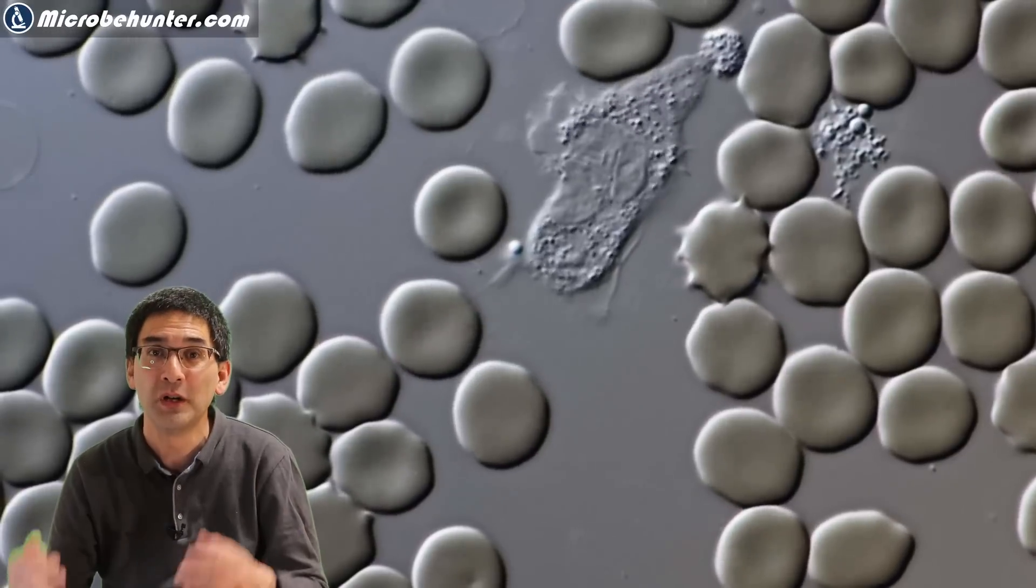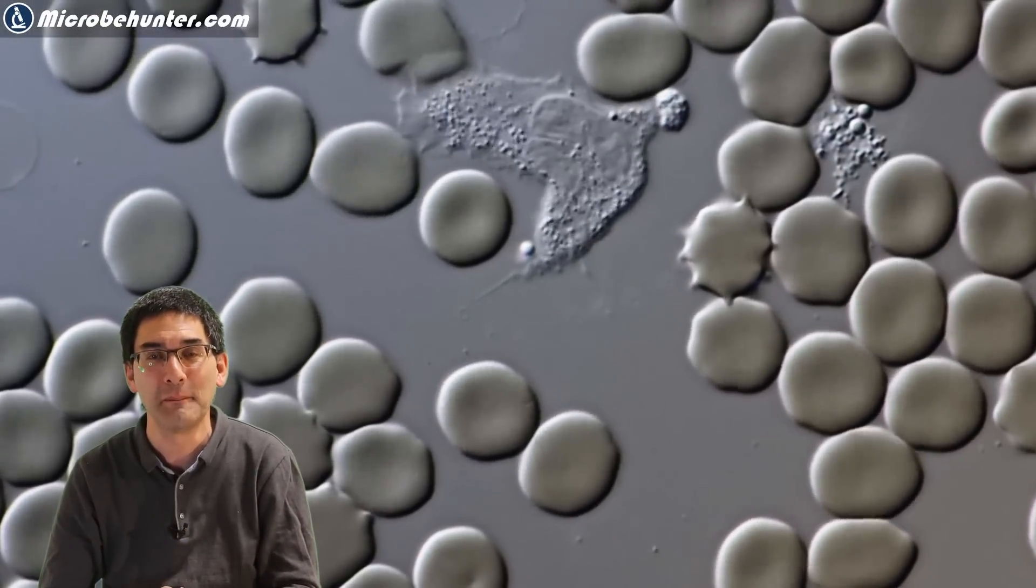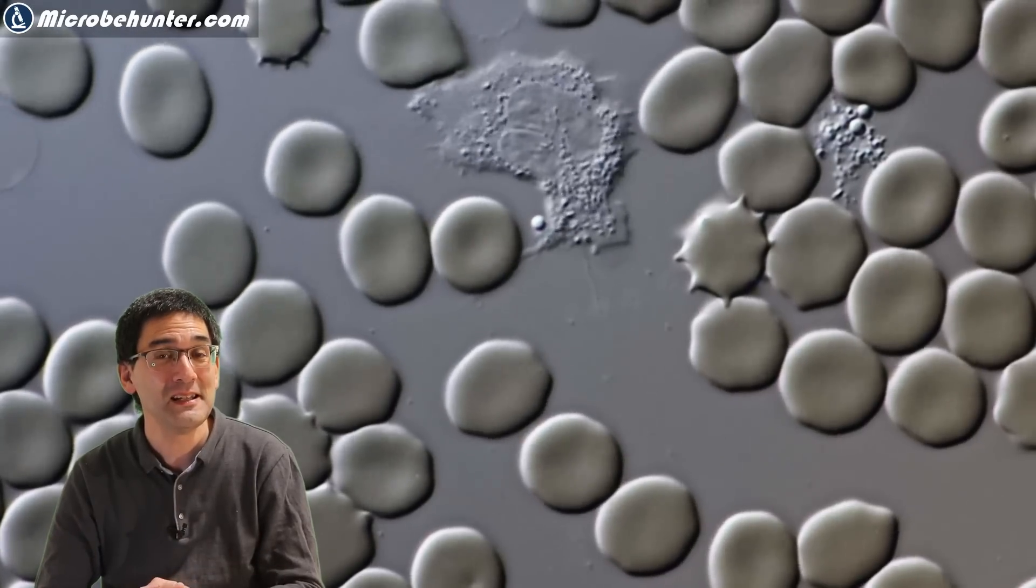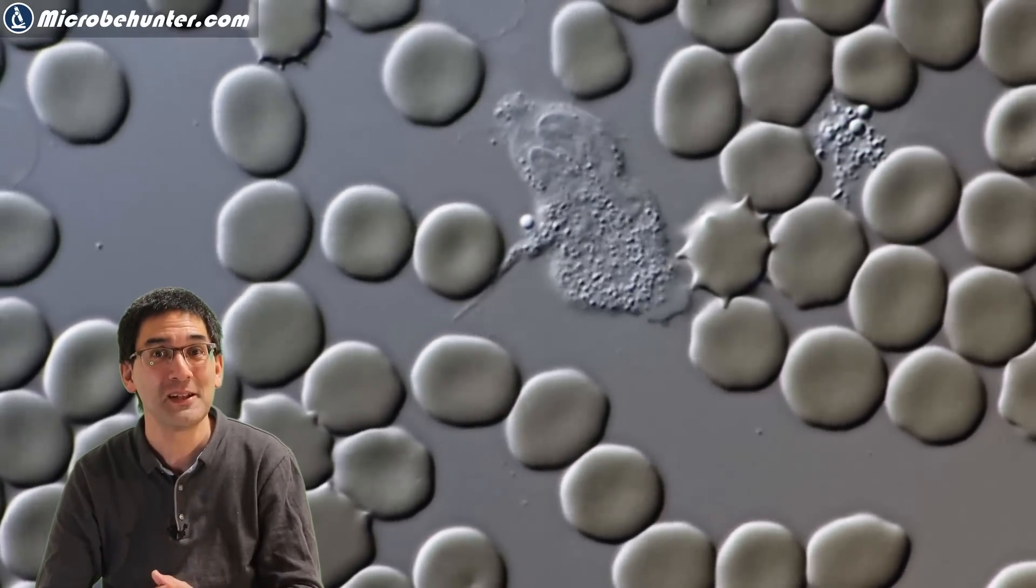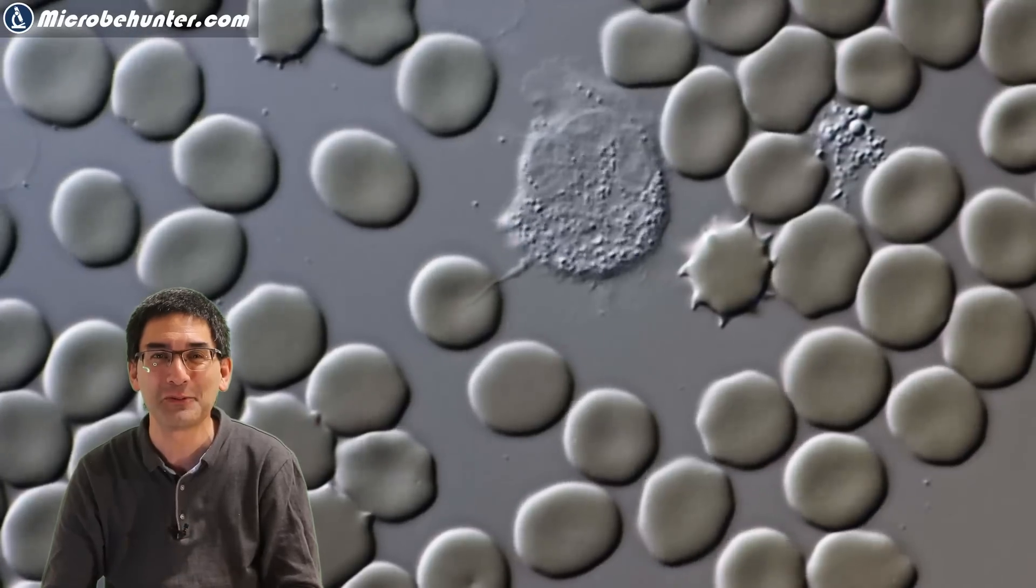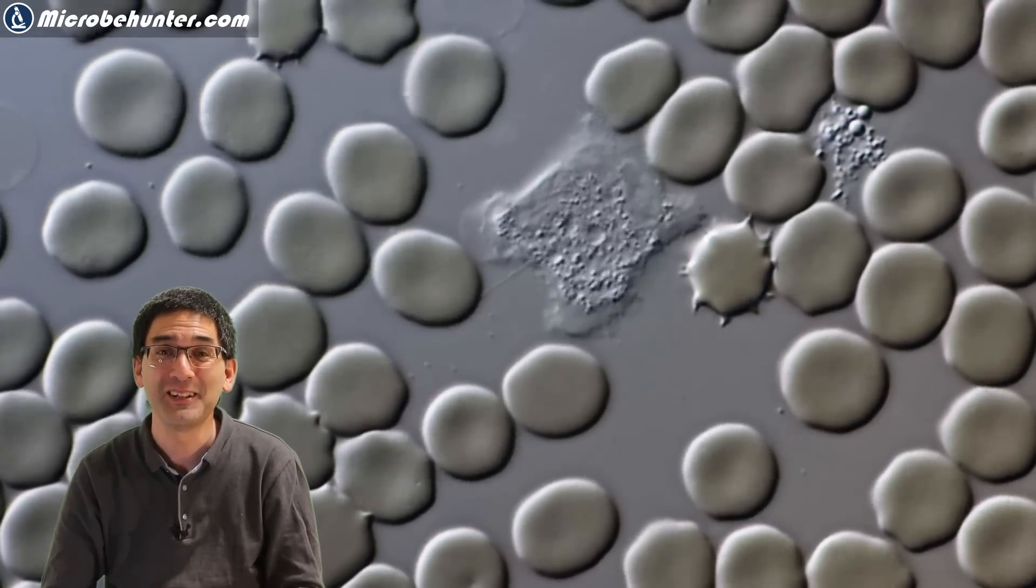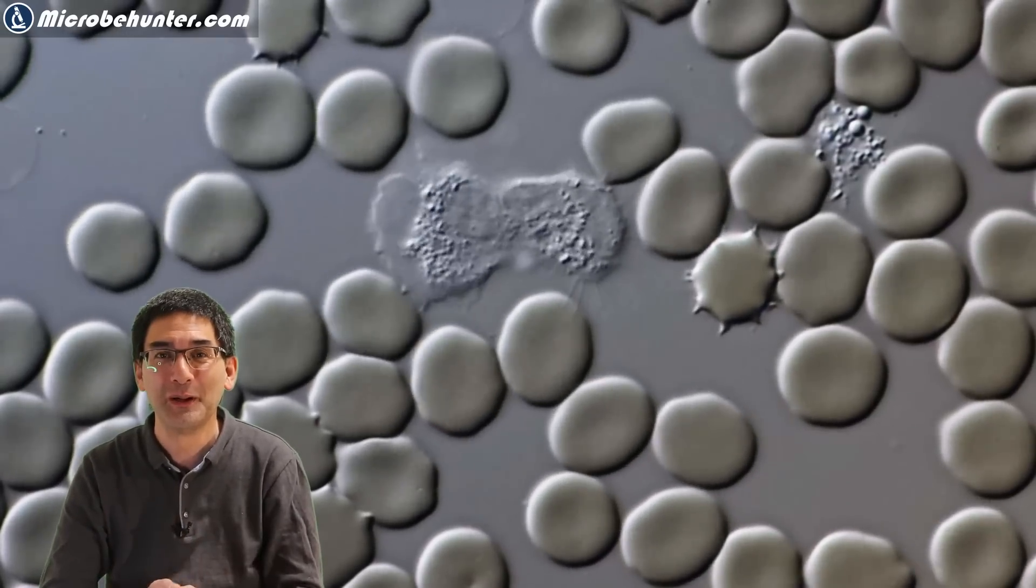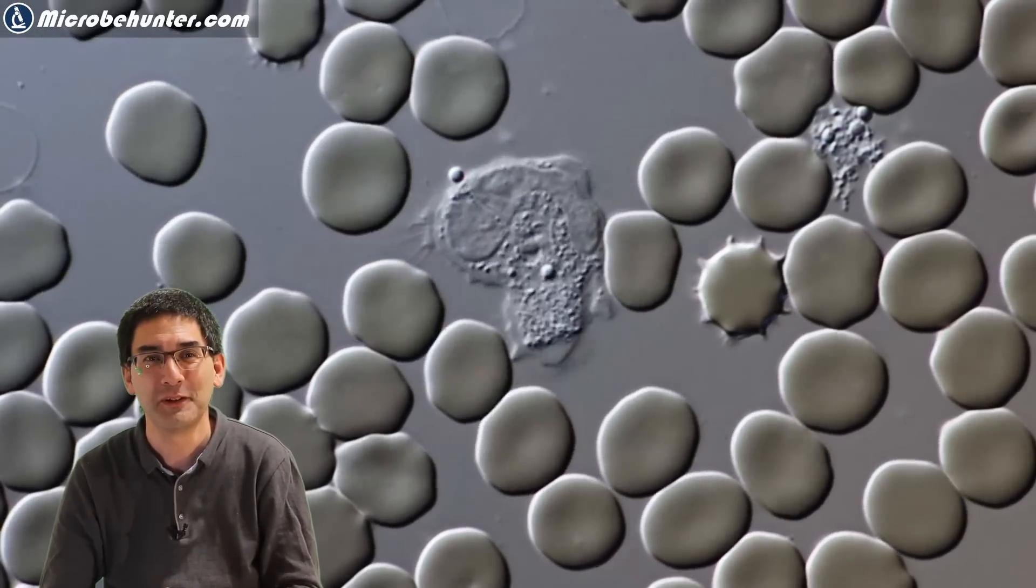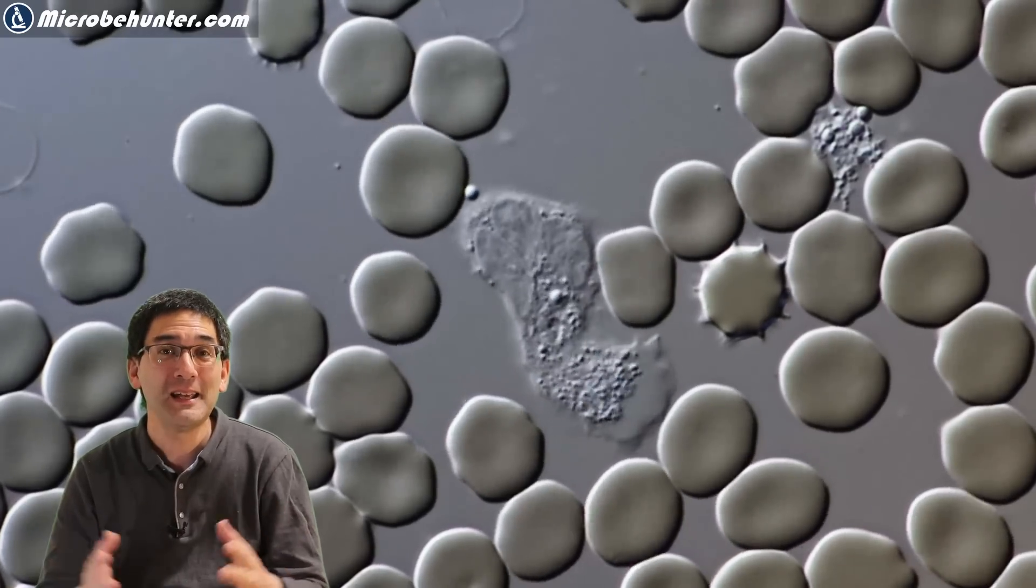I think that for today this is enough. I hope that this is also motivating you to put a little bit of your own blood under the microscope. It's quite interesting to see that so close to us there's so much going on. As a matter of fact, inside our body, so many interesting processes of life to observe.